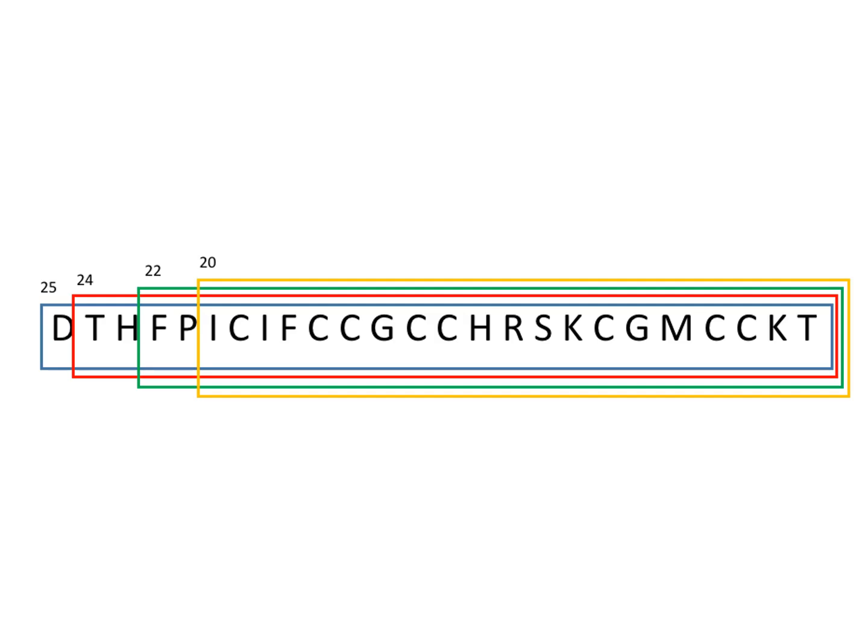There is agreement that that's not the case, and we as yet don't completely know the function of hepcidin 20 and 22. In this figure, we show the amino acid sequence and the points of cleavage for hepcidin 25, hepcidin 24, hepcidin 22 and hepcidin 20.